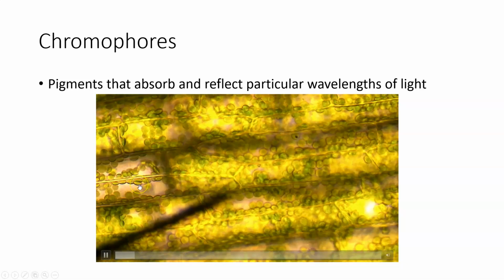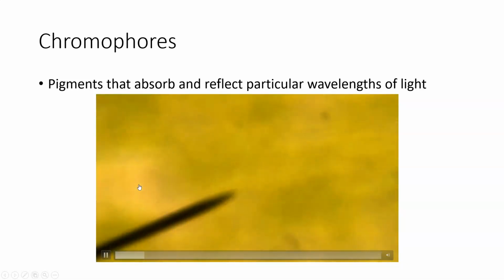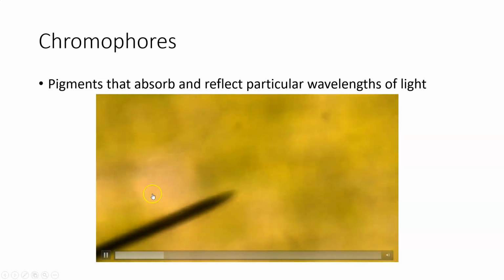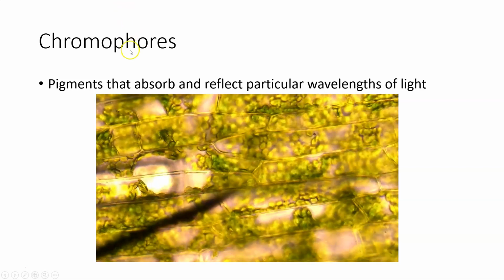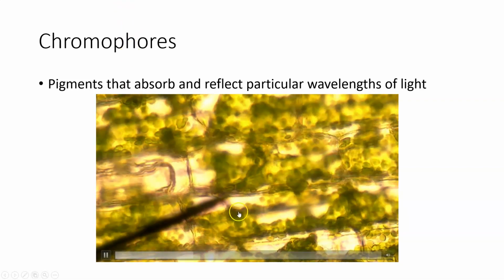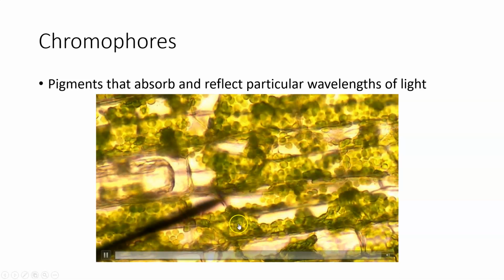And these little green structures that you can see, well, that you could see a second ago, it'll come back into focus in a second. Those are chloroplasts. Chloroplasts have chromophores that are made out of chlorophyll, which is the pigment that actually makes them green. So those you don't have to stain, they just look that way.